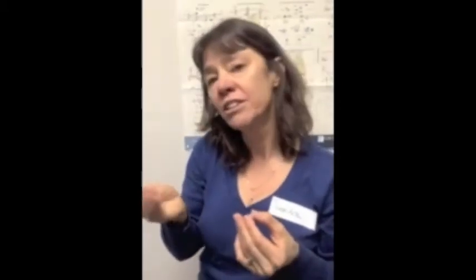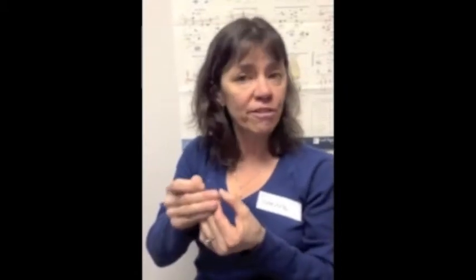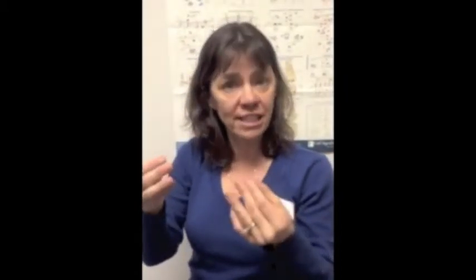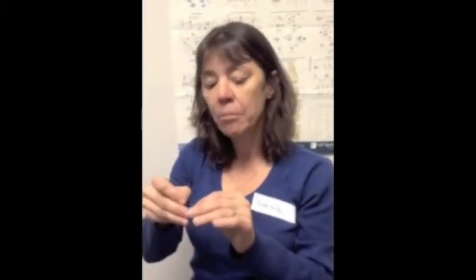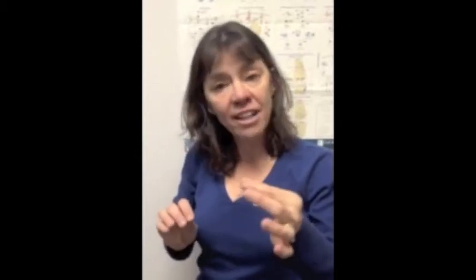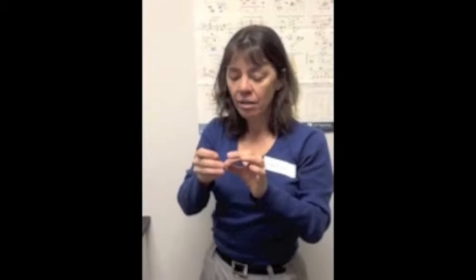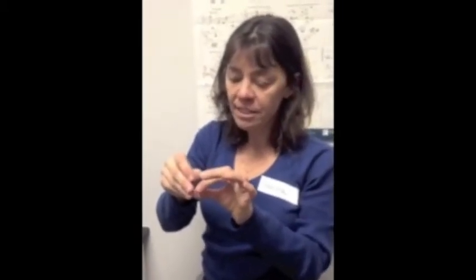We're interested in regions, as I said before, like the nucleus accumbens, the prefrontal cortex, and other regions that are involved in things like reward, social behavior, emotional regulation, and like that. So this guide cannula is surgically implanted into the brain, and then we allow a week or two for recovery. Recovery actually happens pretty fast in the subjects.